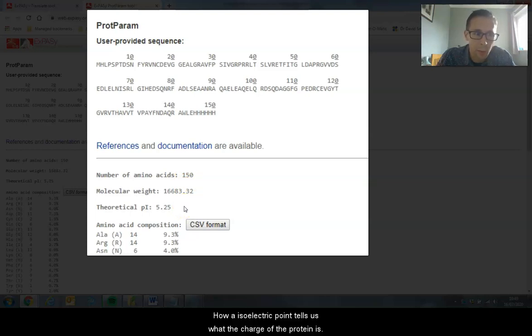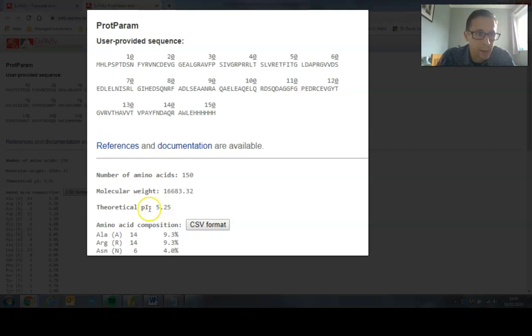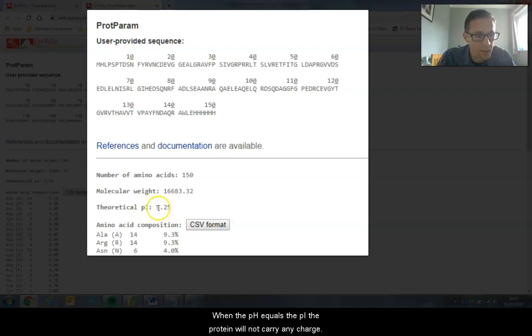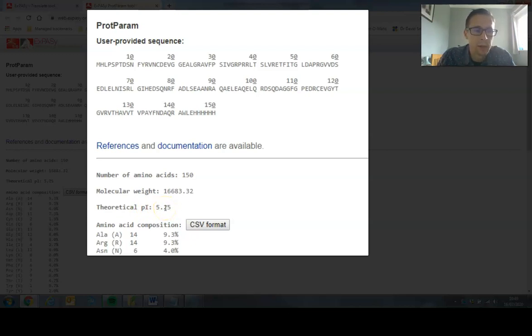An isoelectric point tells us what the charge of the protein is. When the pH equals the PI - so in this case if the pH was 5.52 - the protein wouldn't carry any charge.